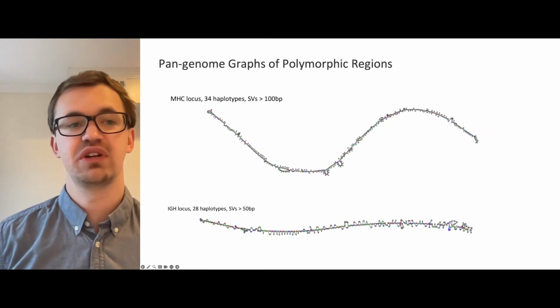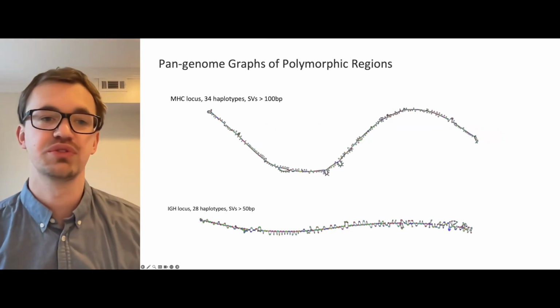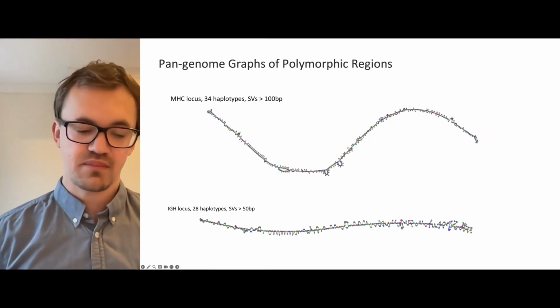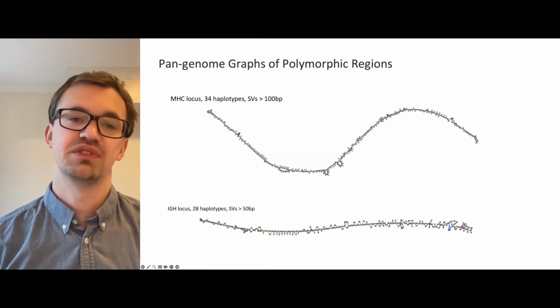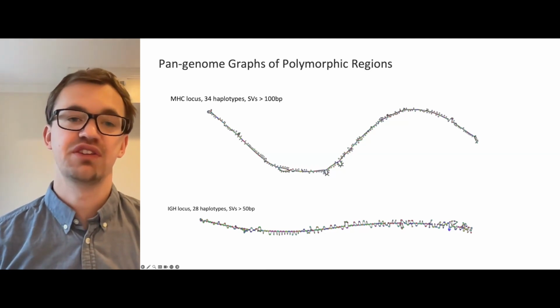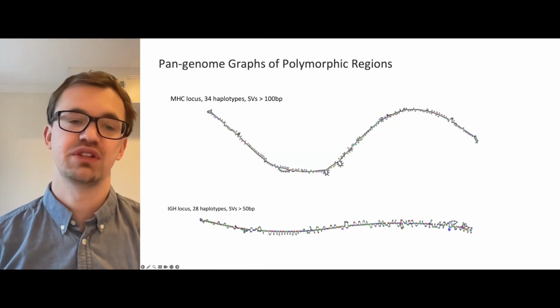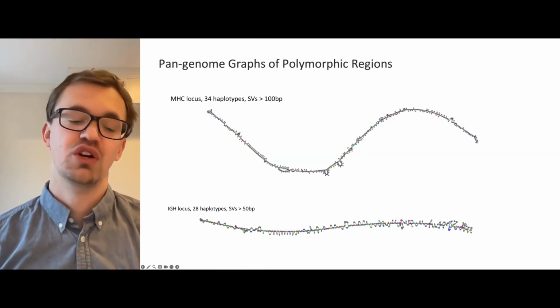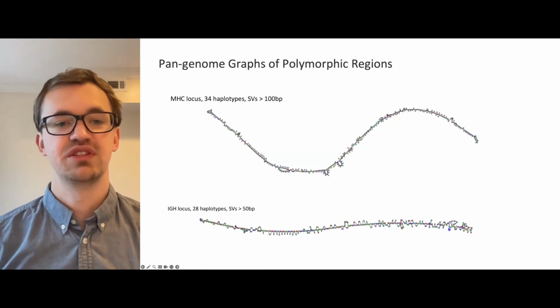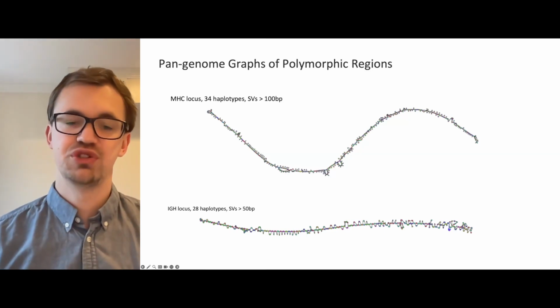And B cells actually have a rearranged IGH locus, making it difficult to analyze the germline evolution. But since we have brain tissues, it's actually in a germline state. So this gives us a very nice resource for the groups who are interested in studying this using immunogenomics approaches.